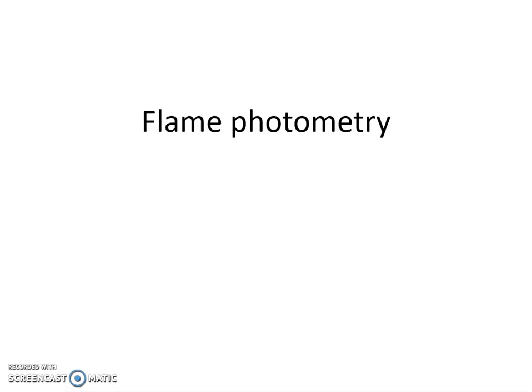So in this video I am going to talk about flame photometry. We will discuss the introductory parts of flame photometry. Then I will discuss what information we are getting from flame photometry. So let us start learning flame photometry.